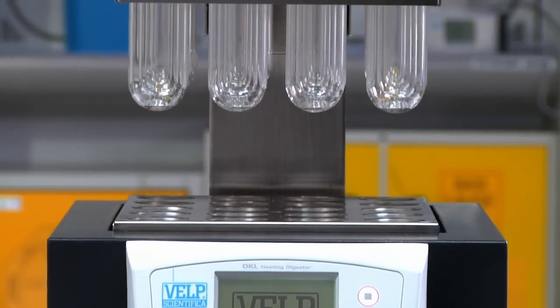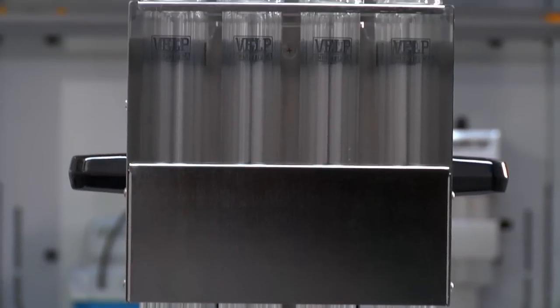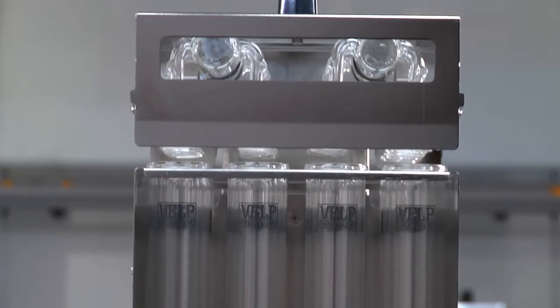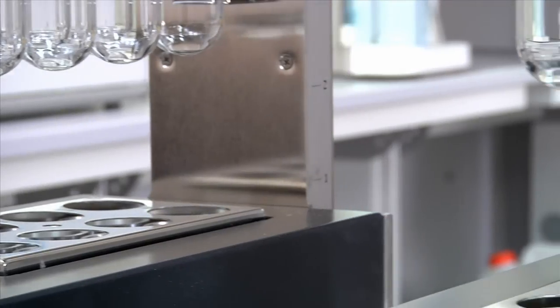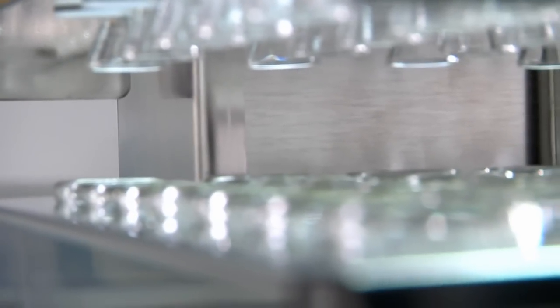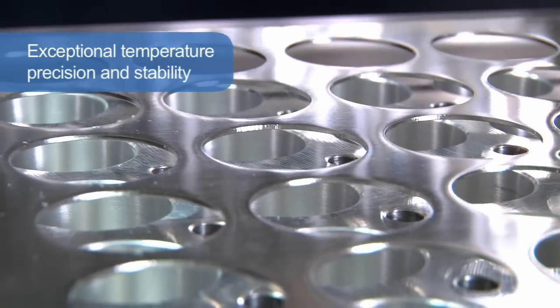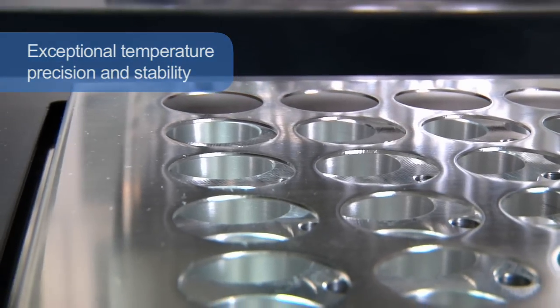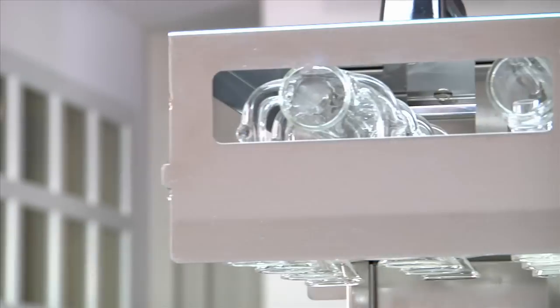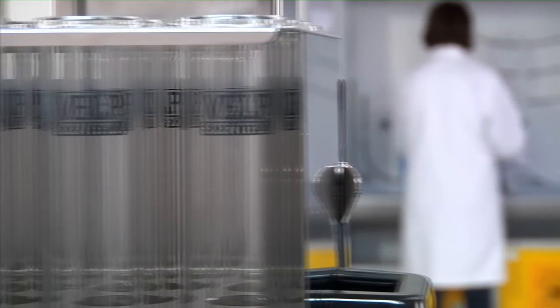DKL Series – Fully Automatic Kjeldahl Digestion Units. The new automatic Kjeldahl digesters from Velp Scientifica provide users with the ultimate technology, whose objective is to simplify operation and improve safety. The DKL Series offers exceptional temperature precision and stability, only plus or minus 0.5°C for all samples, covering a temperature range from ambient to 450°C.